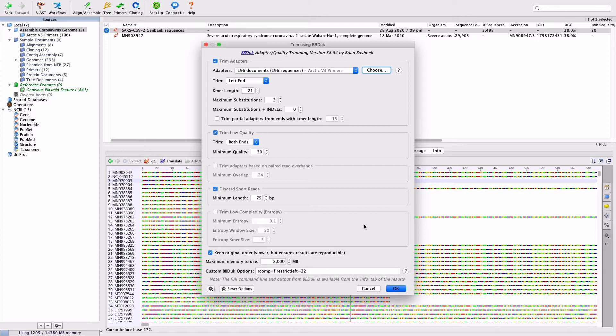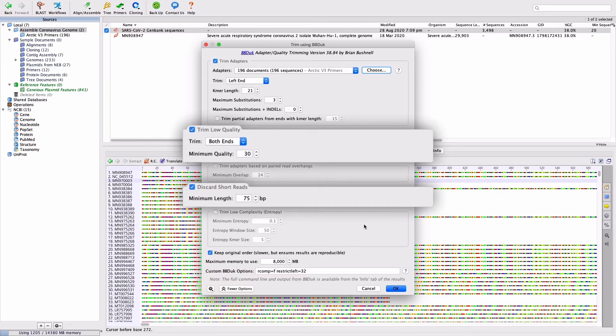To trim off low-quality bases and filter out short reads, set Trim Low Quality to 30 and discard short reads to 75 base pairs.